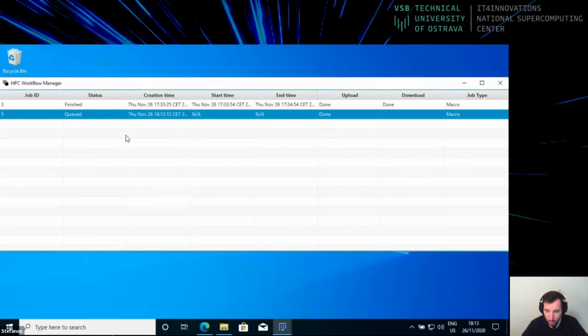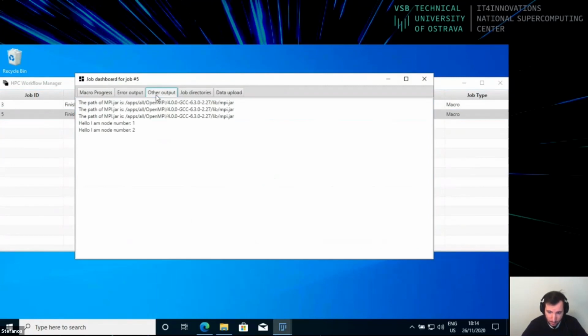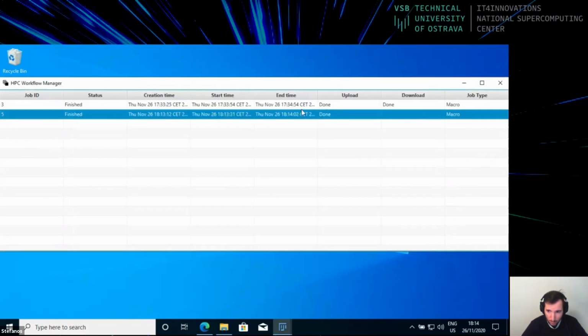So you should start the job as well, and this will run. But I have intentionally made that error. In my case, I will forward this a bit, and we will see that now it's running. Okay, so the status is now running. Once it has finished, I'm going to double click on this job to see the output, and I can immediately notice that the output, which would regularly be in the monitor if we run this in serial in regular Fiji, is wrong.